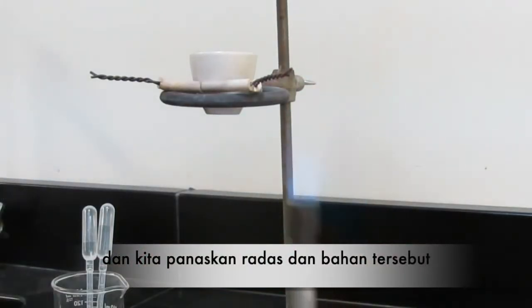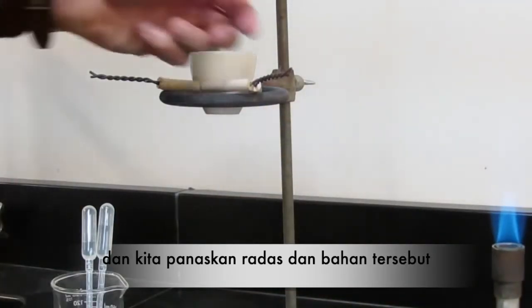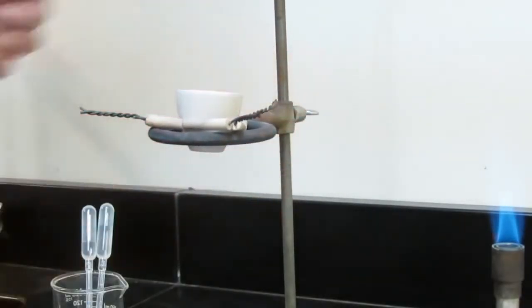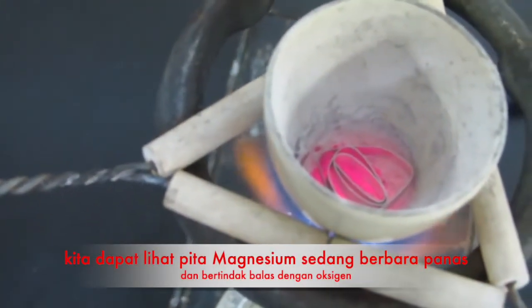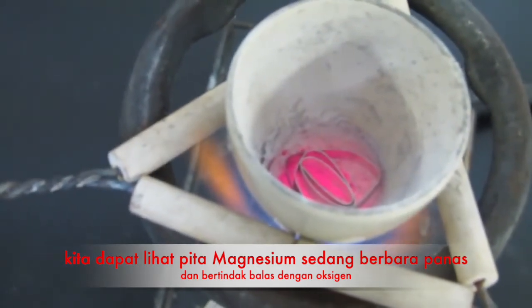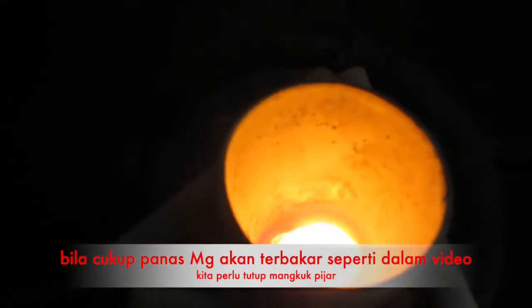And the best height would be, I'm going to lower this just a little bit and make sure you do this while it's cool, not hot. The height of your flame should be so the tip of that inner blue cone is at the base of what you're heating. So that is nice and hot, and we'll get that to react with the air in the room here, hopefully before long. You see that the magnesium is burning in the air.